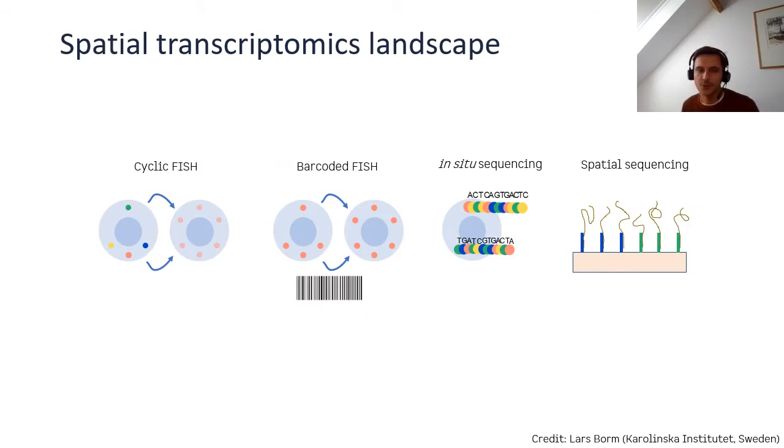Thank you, Jasper. So indeed, the current state of the spatial transcriptomic landscape has many technologies that allow you to really go beyond what we know from traditional single molecule FISH in terms of multiplexing. There are many technologies allowing you to interrogate a lot of genes per sample, and you can categorize them in 4 major different classes. I will go over each of these classes and explain the strengths but also the weaknesses, and these classes are really defined by how the chemistry works.